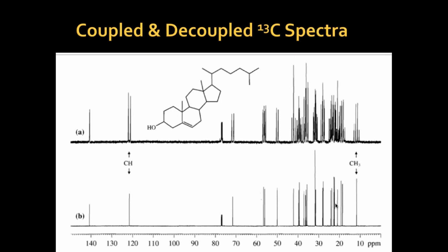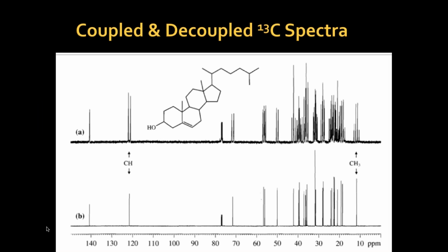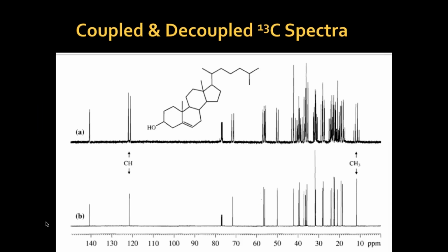We will not go into the detail of this because time does not allow us. This will be another session. We will have another session on C13 NMR and its applications, along with the applications of proton 1H NMR. If anybody is interested, they can join our next session on C13 NMR.